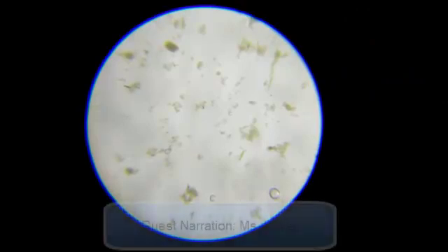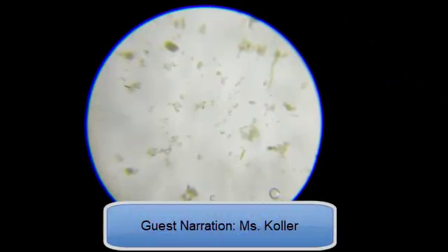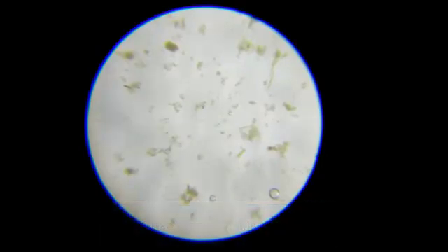So what you are looking at here is some pond water underneath my cell phone microscope. So we're looking at some pond water from Mrs. Beaver's pond under here.